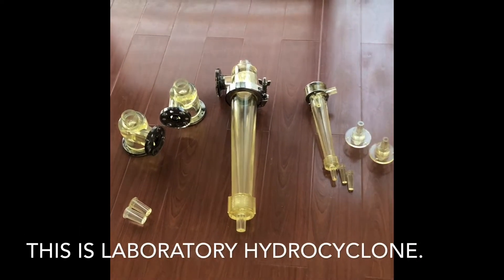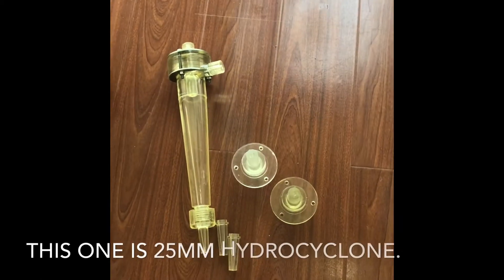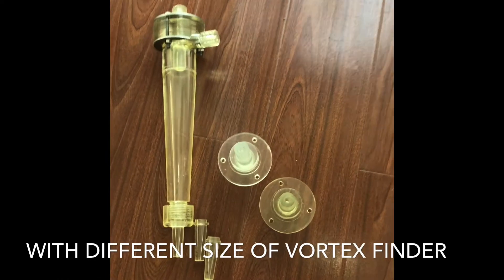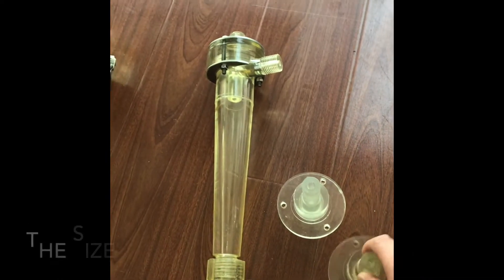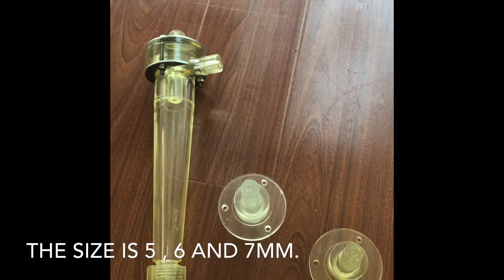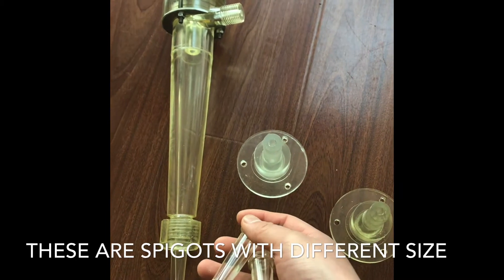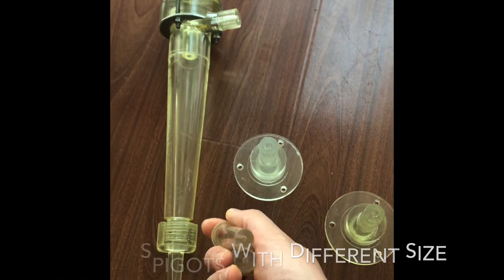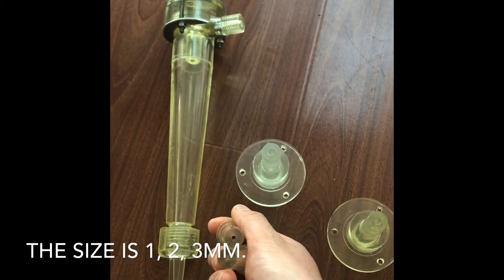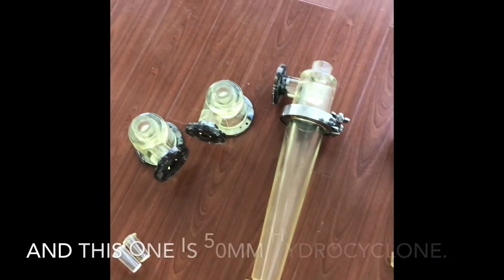This is laboratory hydrocyclone. This one is a 25 millimeter hydrocyclone with different sizes of vortex finder — the sizes are 5, 6, and 7 millimeter. These are spigots with different sizes — the sizes are 1, 2, and 3 millimeter.